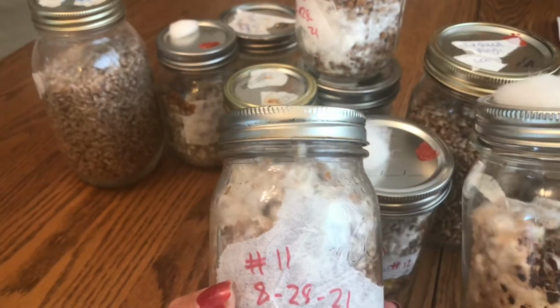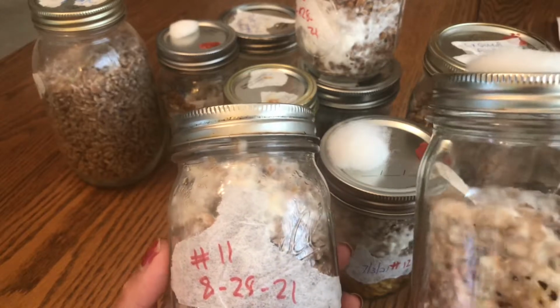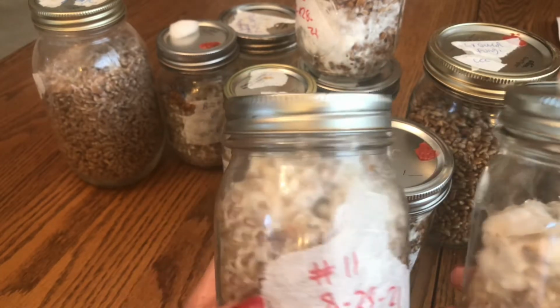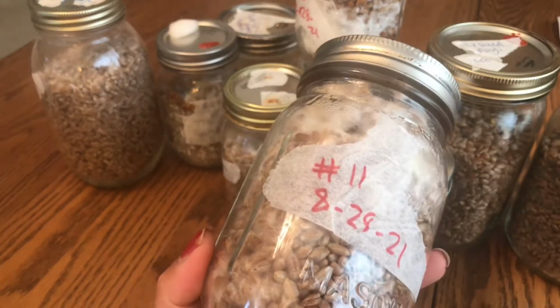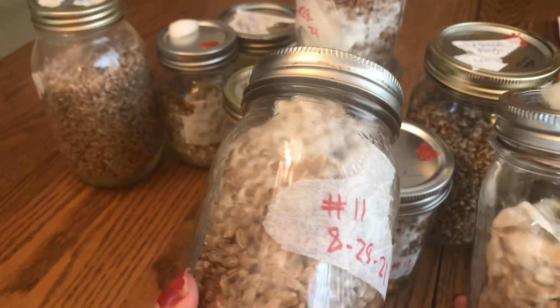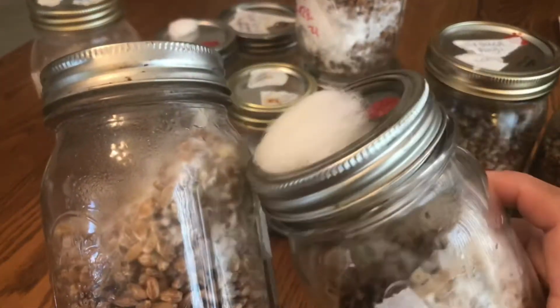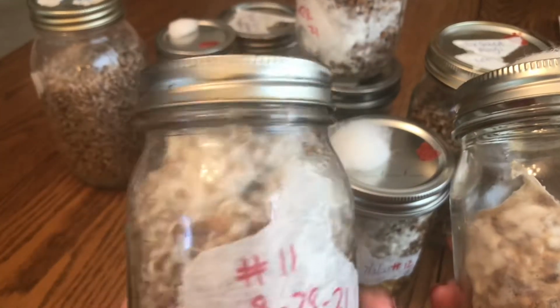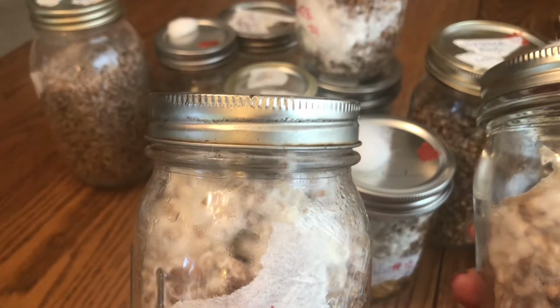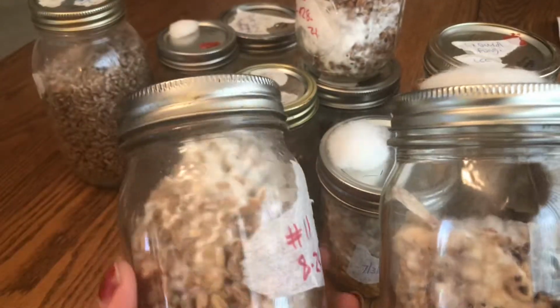So on 8/28/21, I take some of this spore from this one here and put it in this one, and so far it seemed to be pretty good. No sign of contaminations. It's only about, let me see, 2 weeks now, less than 2 weeks. So it's pretty good.